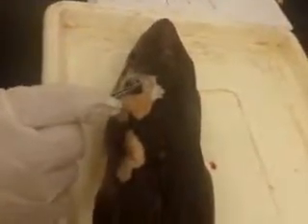And then we have the spiracularis, which is a unique muscle. It's not homologous to anything. You can maybe see it here. It originates in the otic capsule and is inserted in the palatoquadrate, not homologous to anything in the necturus.